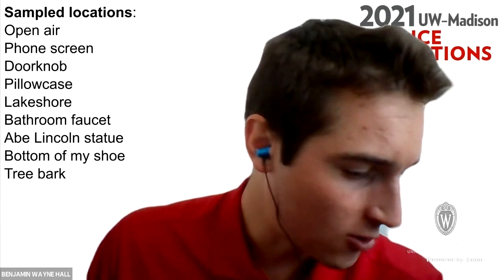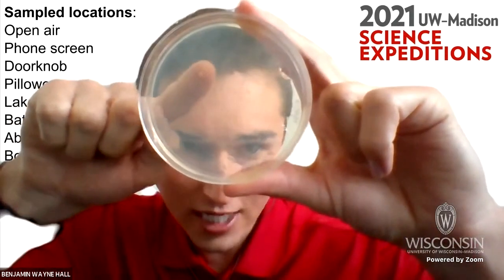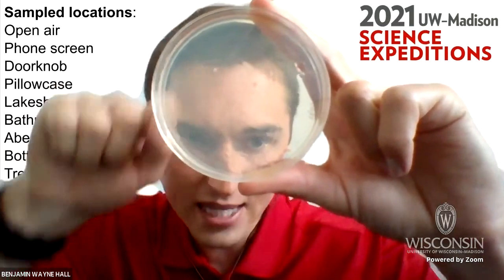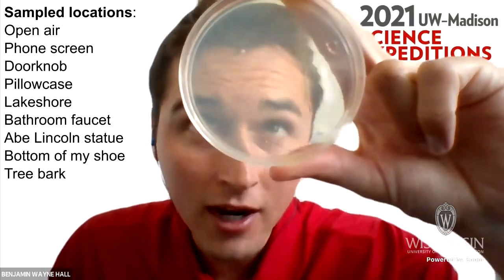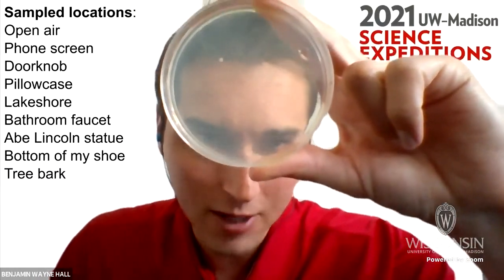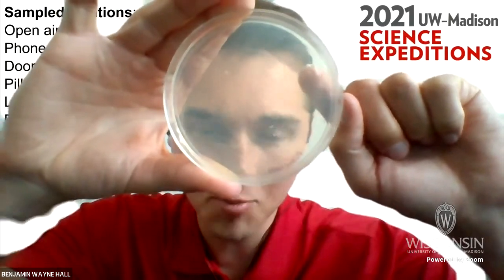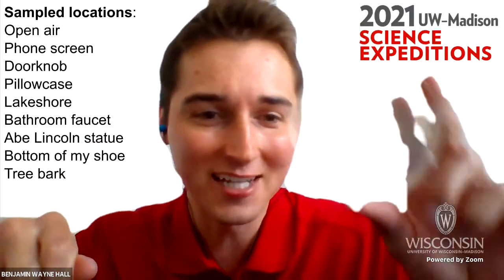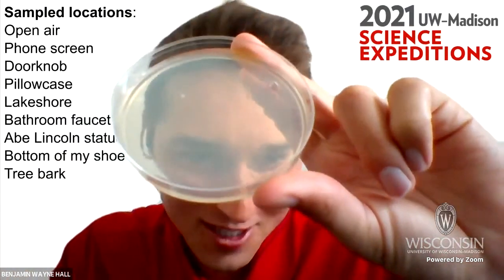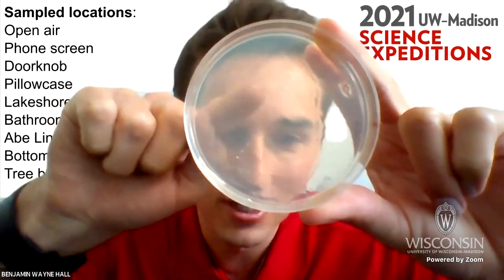Let's look at some of the other ones. We also had the pillowcase brought up. So here on the pillowcase, it looks like we just saw one main colony that showed up on the plate after sampling this pillowcase. If I look around at the rest of the plate, it doesn't look like we have anything else in here. And some of you might notice this big splotch on the plate. That's actually my fault. When I was using the Q-tip, I stabbed the plate too hard. So I ended up just messing up the agar. But the bacterial colony is this circle that we see right here.